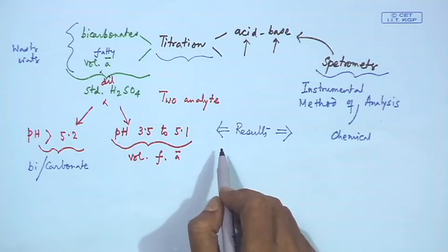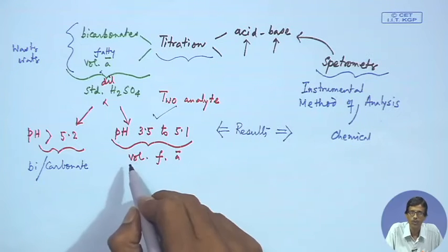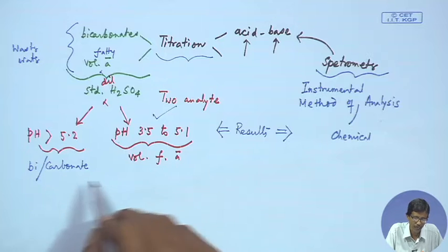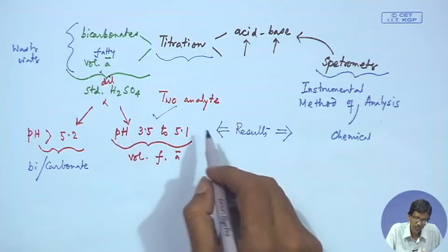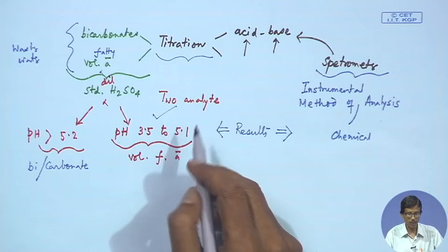If the results are comparable, we will find that manual titration is very good and we can use it for analyzing this.